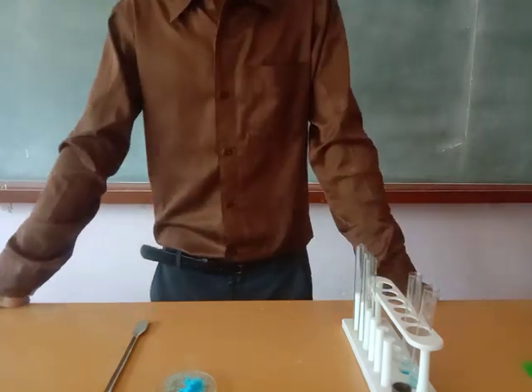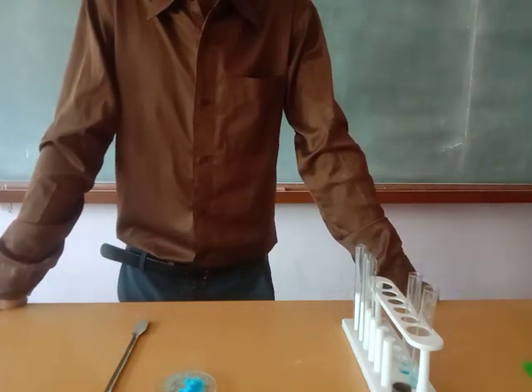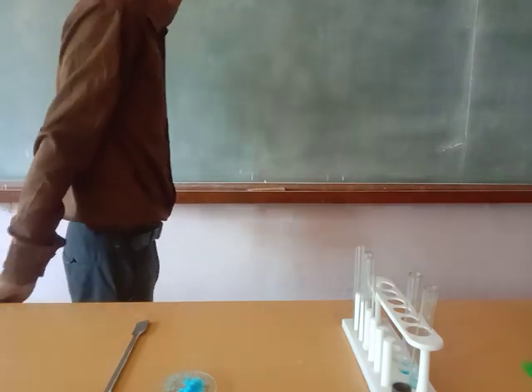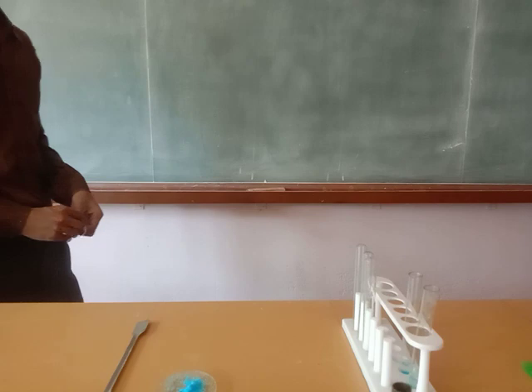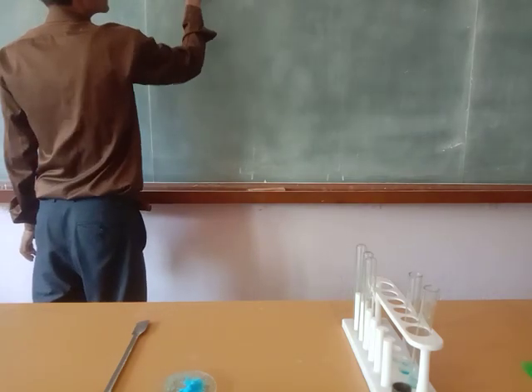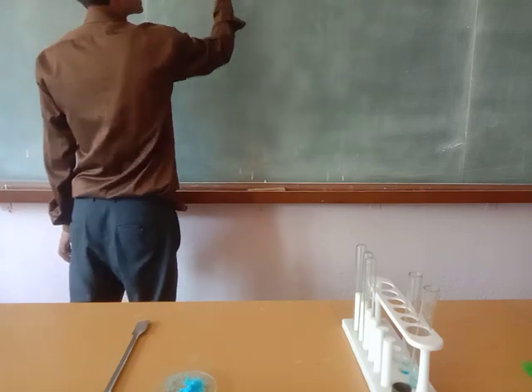So basic radicals are divided in some groups. The wet test for basic radical is also called group analysis.